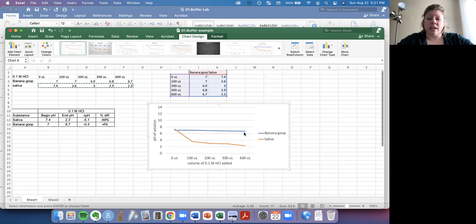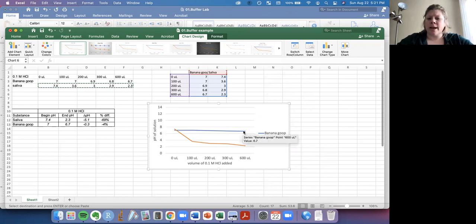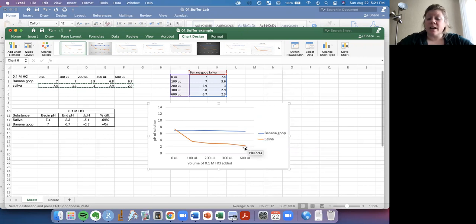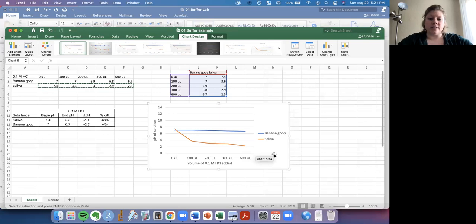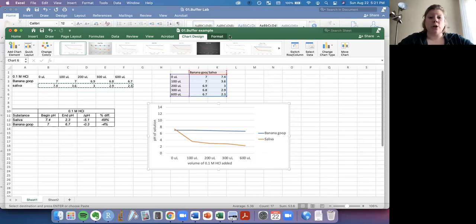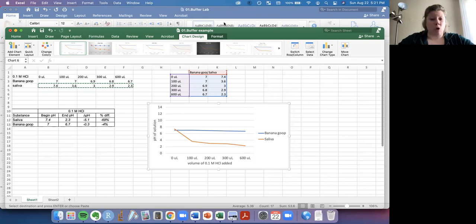But that looks like the type of graph that we want to see. If you're feeling really fancy, you could figure out ways to put that this is a minus 4% change and this is a minus 69% change in the pH. But as it is, this graph does a great job summarizing the data that you found in your experiment. So I hope this helps you think about how to share, analyze, and summarize the data that you're looking at.